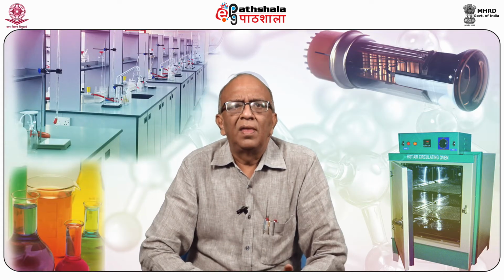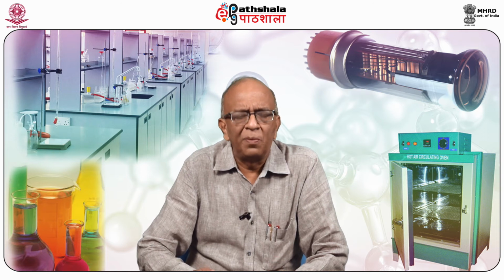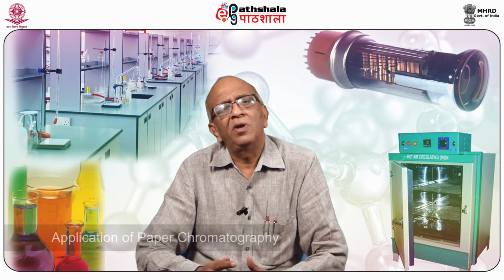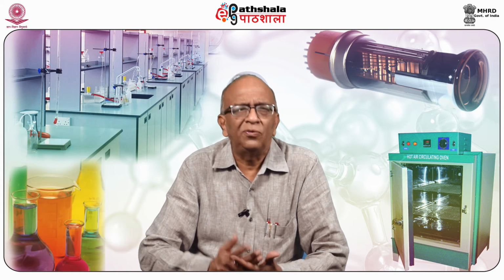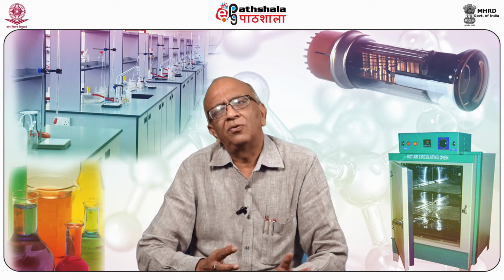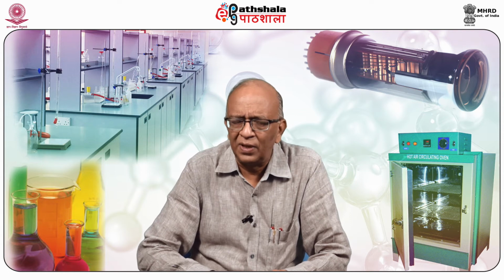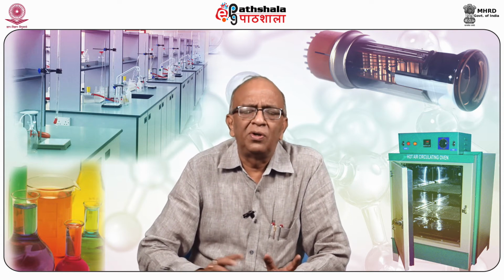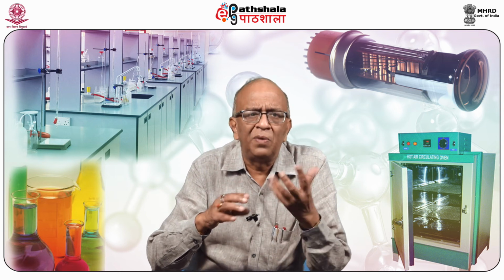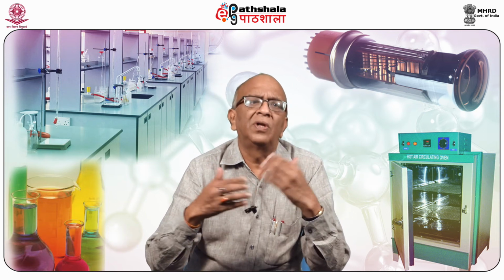Students, after appreciating the technique and principle of paper chromatography, you should also know the applications of paper chromatography. The technique is very simple, very easy, and can be carried out in a very short period of time, so it has a large number of applications. One of the basic applications is testing the purity of the synthesized compound. The synthesized compound may be an organic compound or an inorganic complex, to find out whether it contains impurities or not.